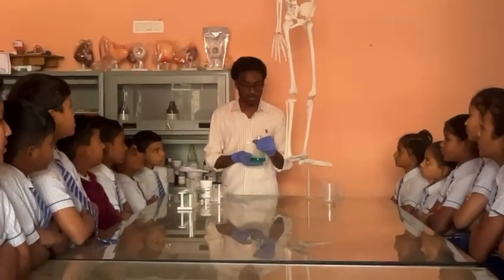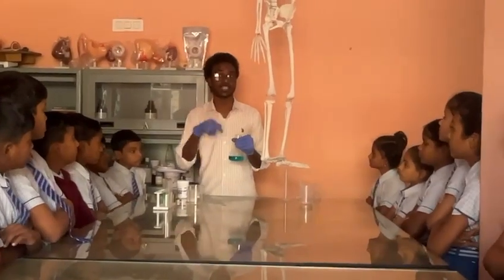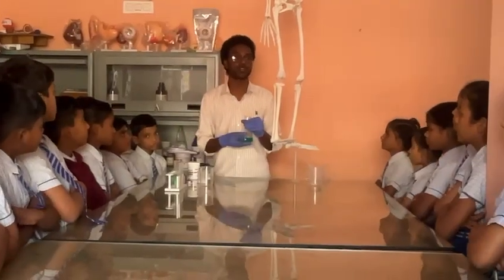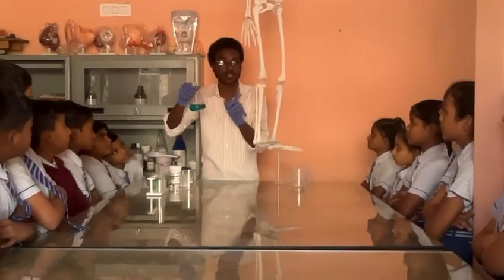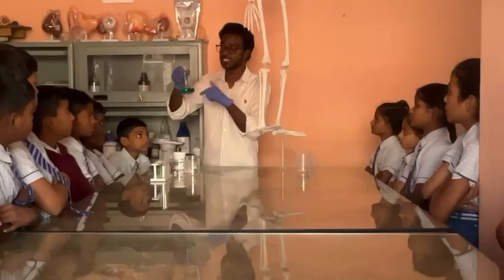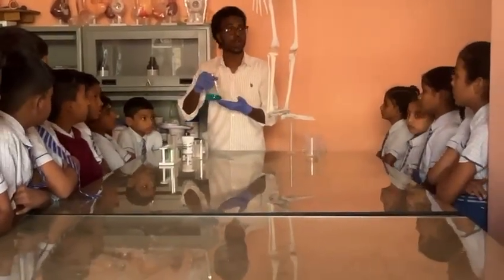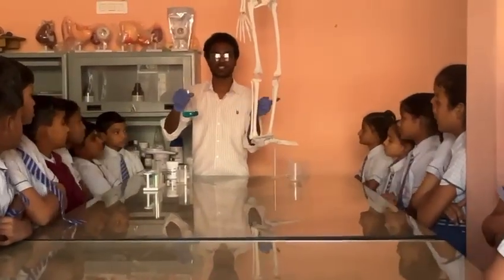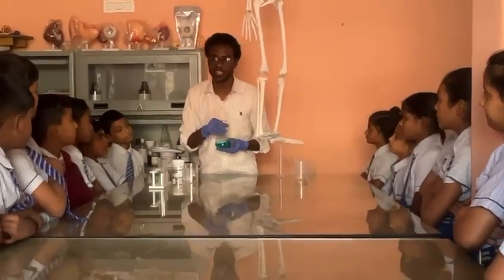And the product will be CuCl2. Because we have added salt, sodium chloride, the chloride will react with copper to give CuCl2. Now this solution is CuCl2. This is not CuSO4 now. CuSO4 is mixed with NaCl, and this solution will now become CuCl2, copper chloride. Because we have mixed copper sulfate with sodium chloride, the solution becomes copper chloride. Got it, everyone? Yes, sir.